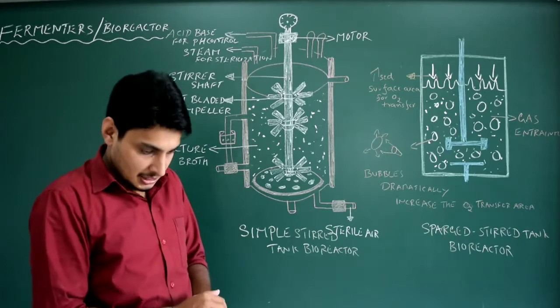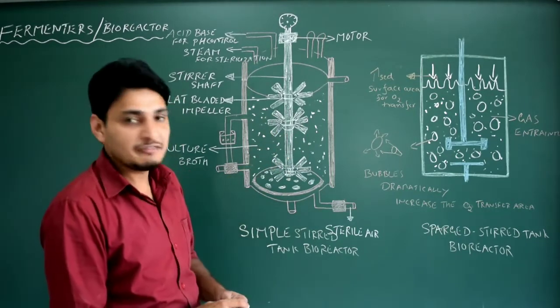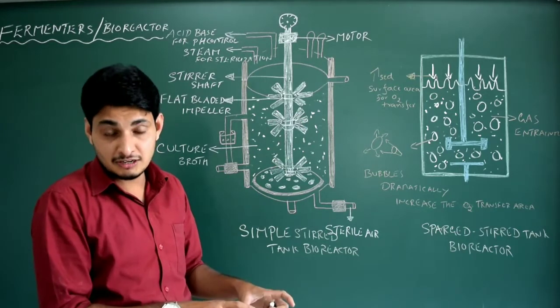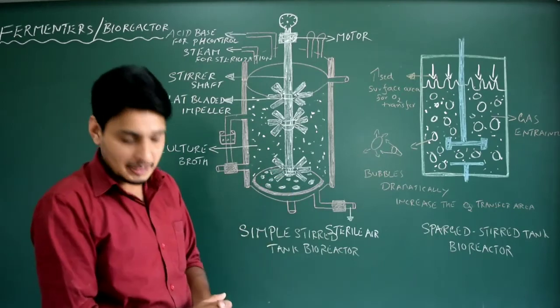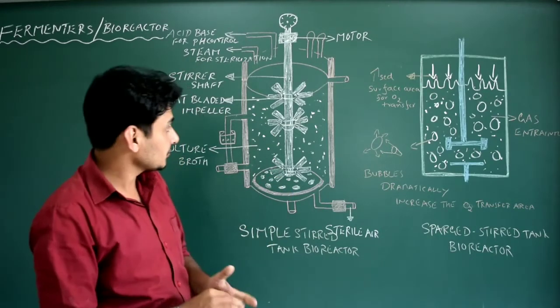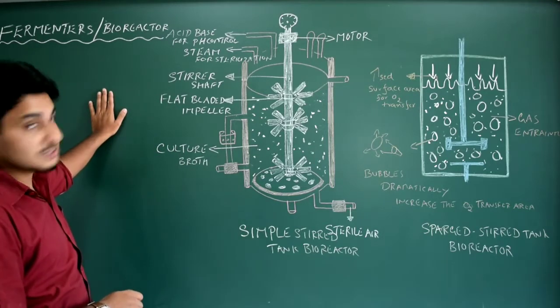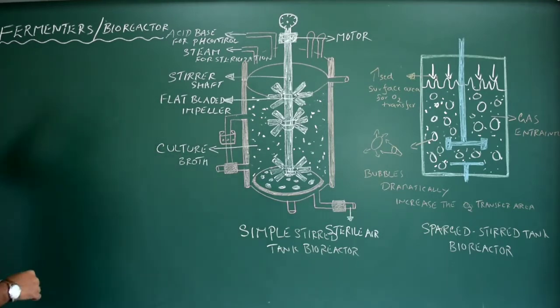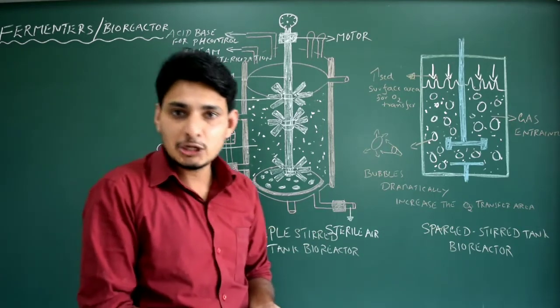So, switching, and obviously I have already drawn the two very important diagrams, particularly for your board examination. They could be asked for 5 marks. Practice very well. I'm a bit sleepy, but listen to me carefully. You are not supposed to sleep. Got it? Okay, chalo. So I'm going to explain the seventh step of rDNA technology.